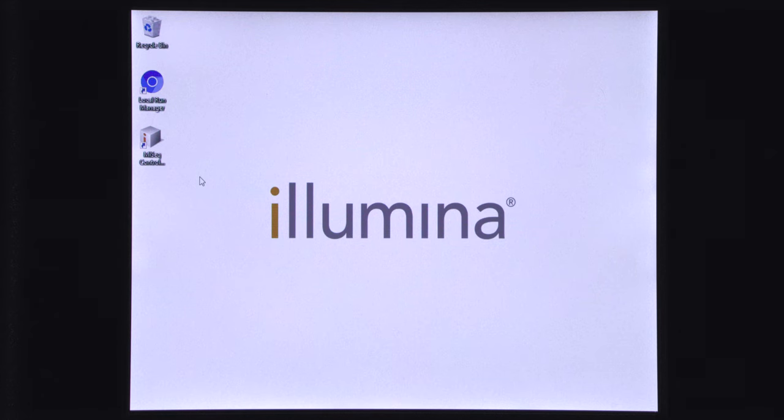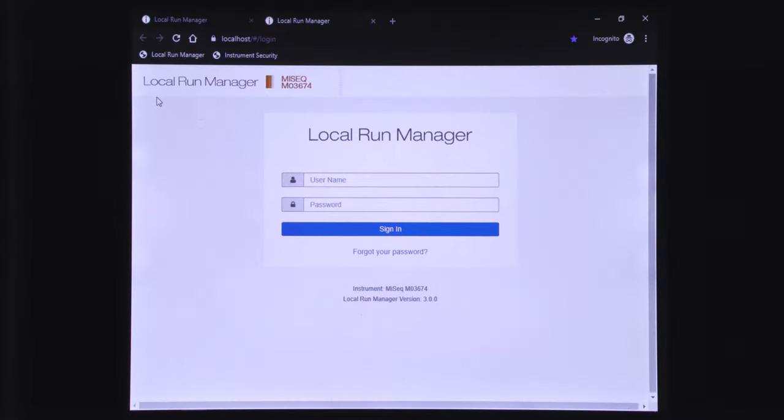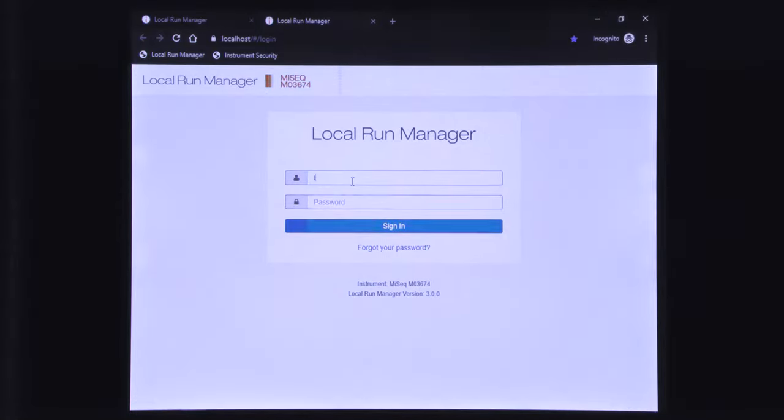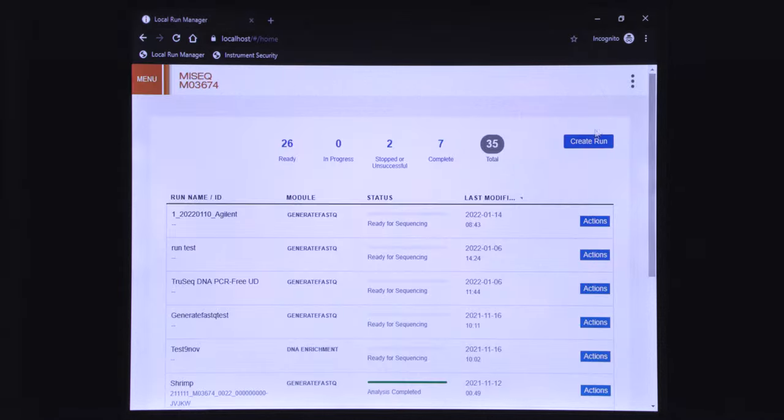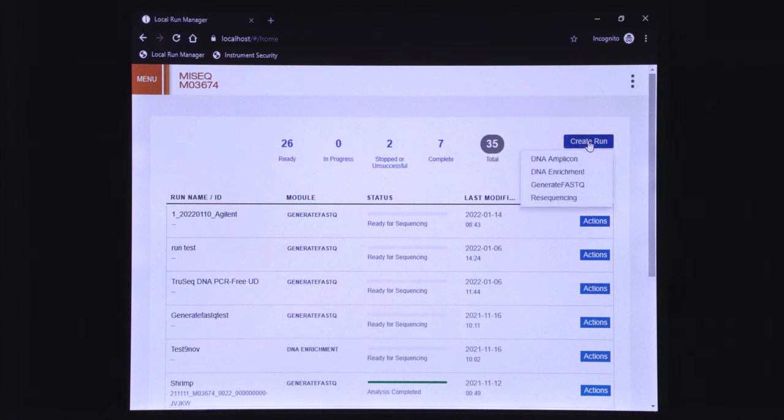You can access the local run manager dashboard by opening the browser link found on the desktop of the sequencer. Insert your local run manager username and password and select sign in to access the local run manager dashboard. From the local run manager dashboard select create run.